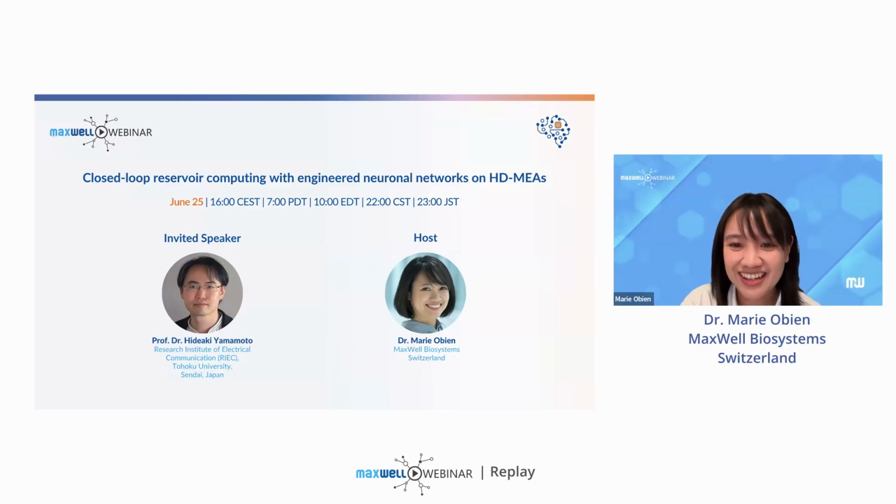Thank you so much. Next, we have a question from an anonymous attendee. Why do you think that higher dimensional reservoirs exhibit higher performance in the sinusoidal wave generation experiments, even though when you plot the PCA components in the activity post-learning, there are low dimensional representations representing the peaks and the valleys of the wave?